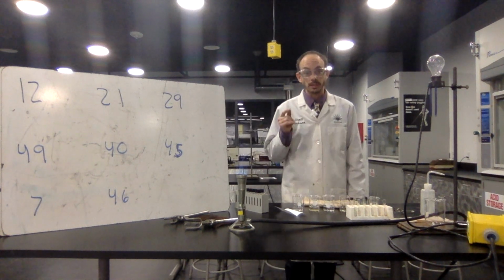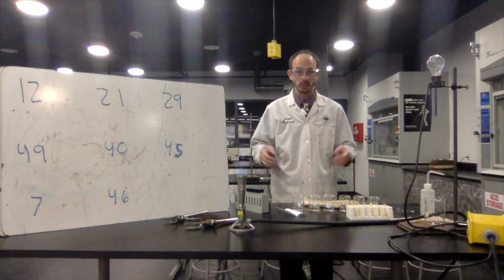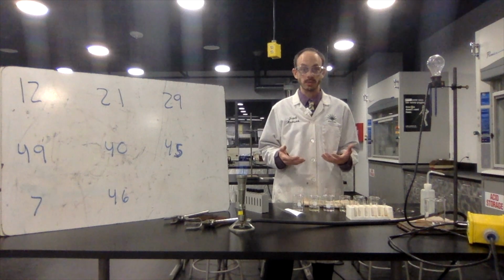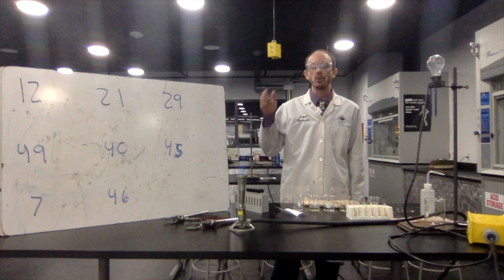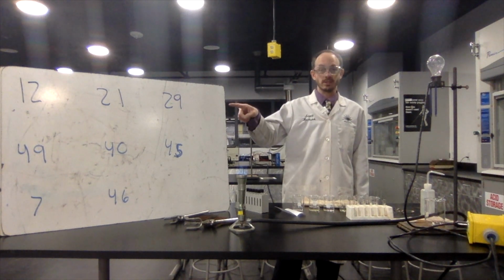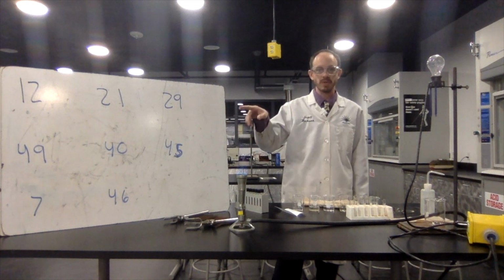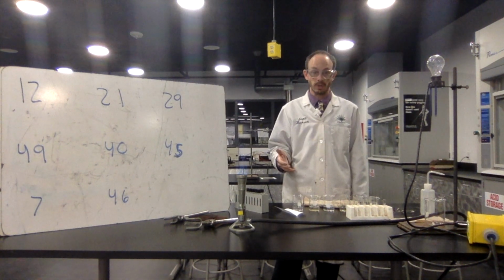Hey ladies and gents, today we're going to be doing this Intermolecular Forces 5 Glues Lab, and we're going to try to detect what's going on inside of each of these substances so that you can identify correctly which one goes with which. I gave you a batch of numbers. The number that I'm testing will always be on this board right here so that you can pick out your number and then follow along the line. Let me show you the tests that we're going to be running today.